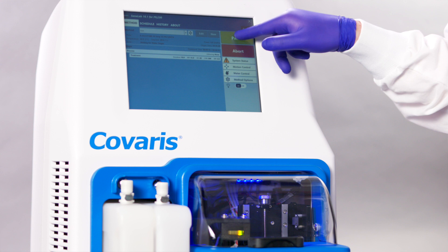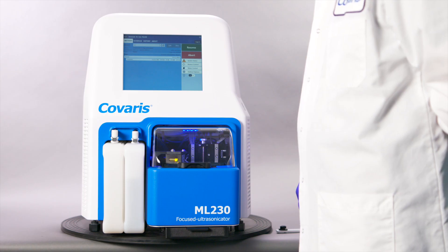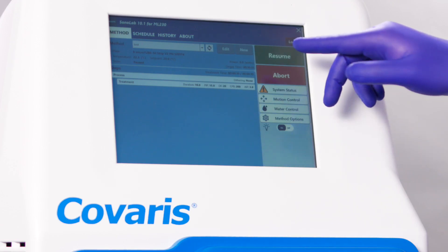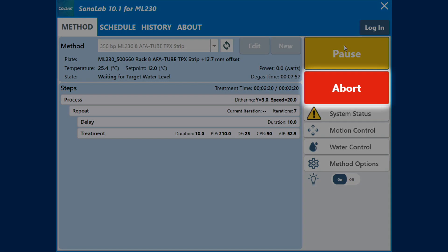The user can touch Pause to pause a running method at any time during the run. If a method has been paused, the user may continue the process by touching the Resume button or terminate the process by touching the Abort button.